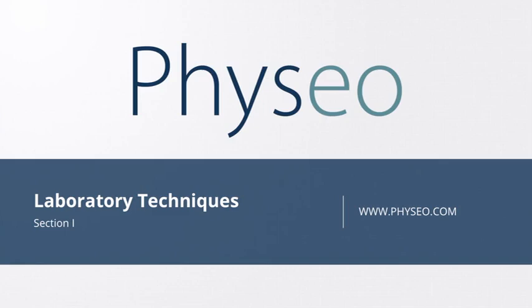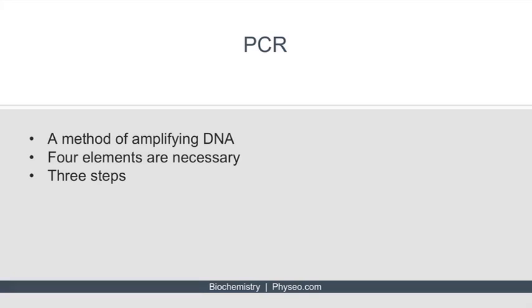Welcome to Section 1 of Laboratory Techniques. In this section, we'll be discussing polymerase chain reaction, or PCR. Let's get started. PCR is a molecular lab technique that amplifies DNA. So it's a method of amplifying DNA.